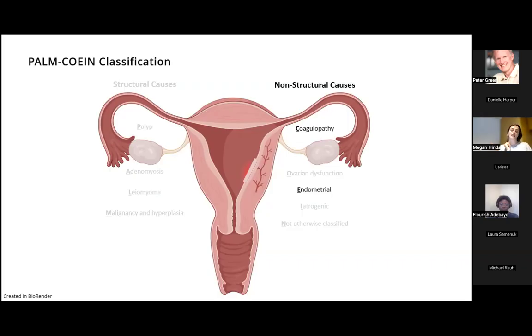I can't quantify anything. And of the immunophenotyping that I have done, this is obviously more so once the cells are cultured, but in the earlier days of optimization, at the beginning of last year, there was tons of variability in different cell types. Obviously, fibroblasts were a big one, and then your endothelial cells, but there is a lot of variability from patient to patient and just from cycle to cycle for sure.